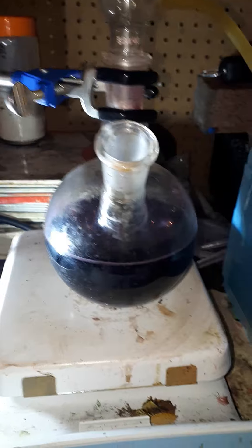Increasing the speed so it stirs well, and I am going to remove this carefully. I am going to pipette a small amount of the hot solution into here.